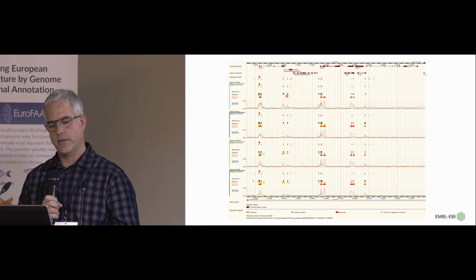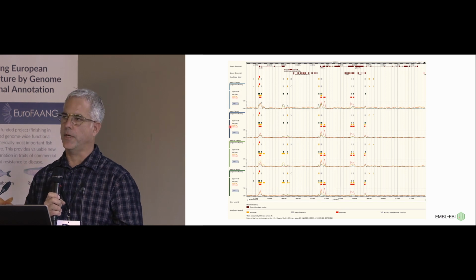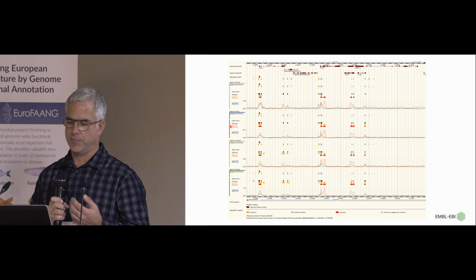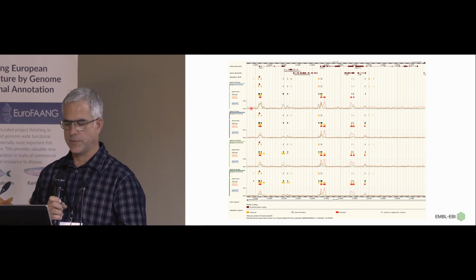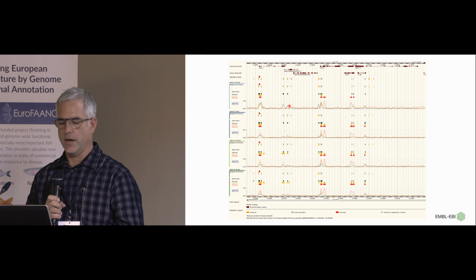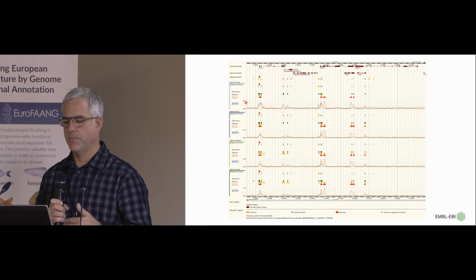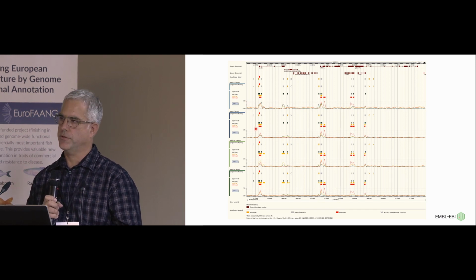I also wanted to highlight we have separate male and female for each of these stages. We could have combined these, but we've kept them separate because, as you can see, the data is very good and gives us pretty clear tracks, even with the biological replicates that are available. And you might be able to find sex-specific differences, but I think what will be most useful is you can see how reproducible these tracks are.